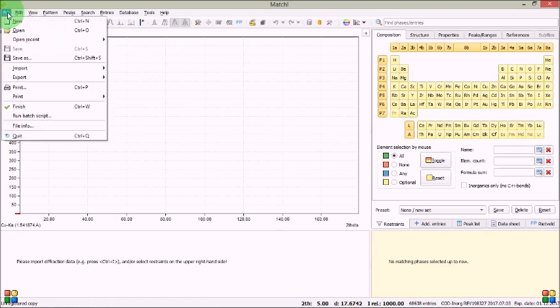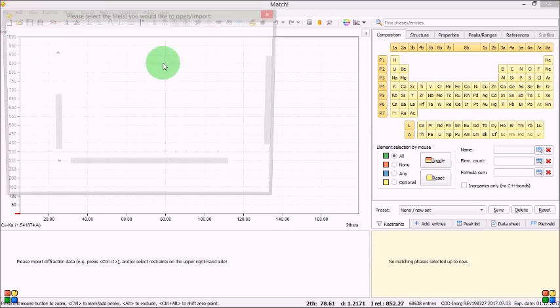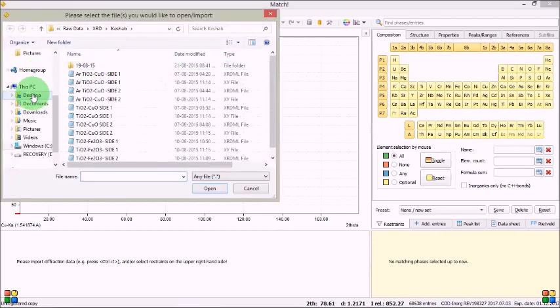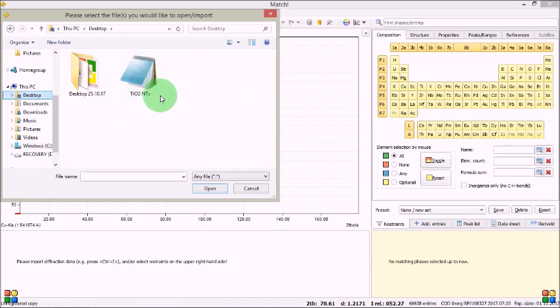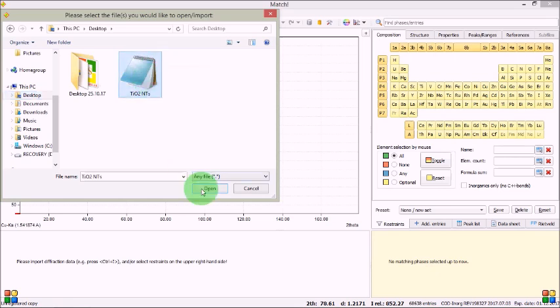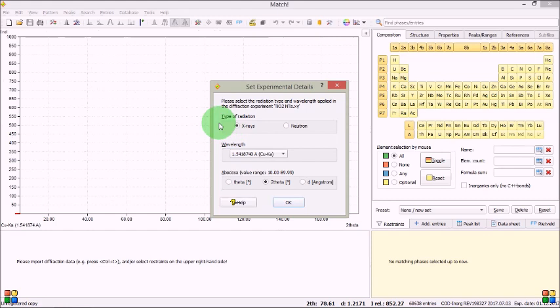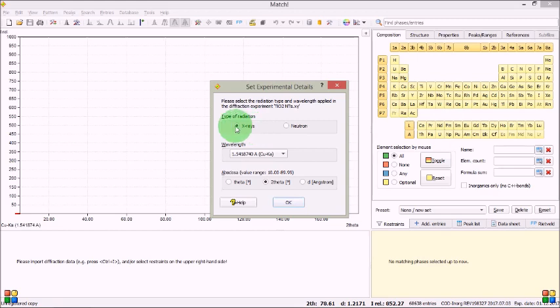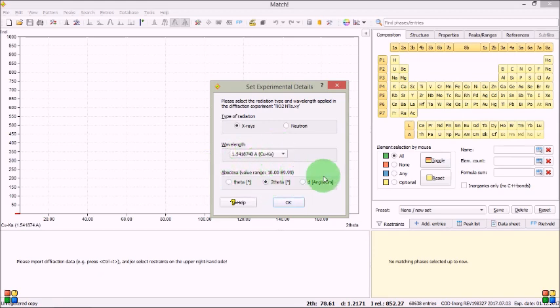First of all let me open an ASCII file. I have kept it here. This is the XRD data of the TiO2 nanotubes grown on the titanium substrate. So let's open it and you can see lots of options here for X-rays for neutron. However, I am only interested with the X-rays and I have used copper K alpha X-ray source and this is the wavelength 1.541.